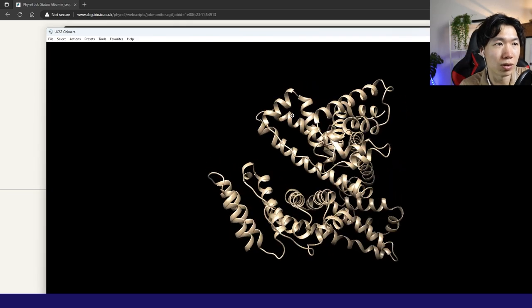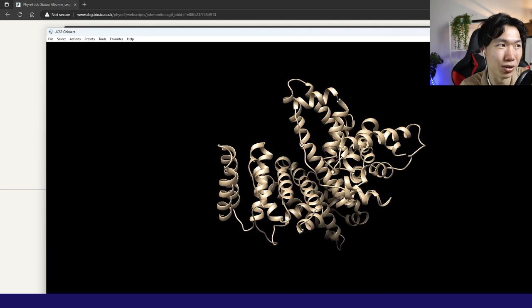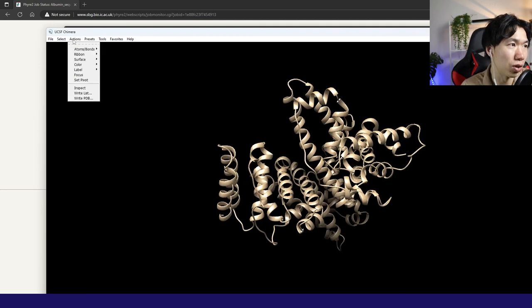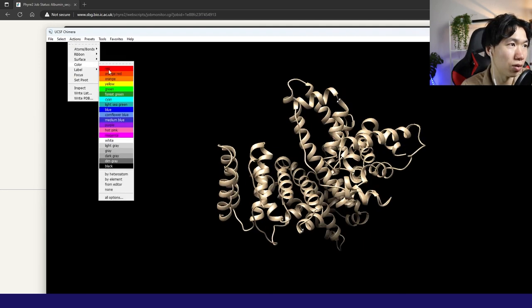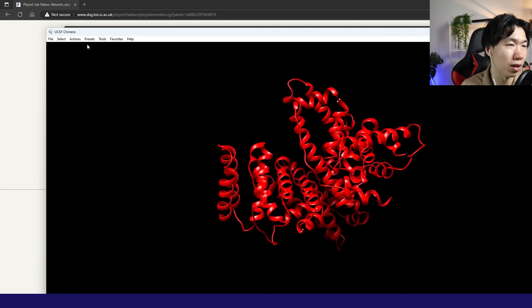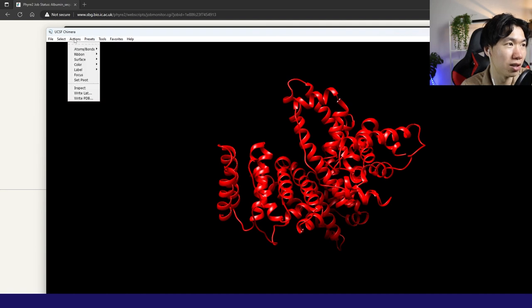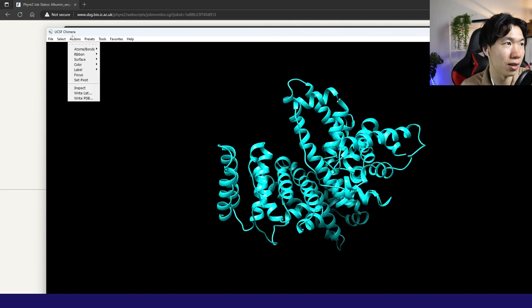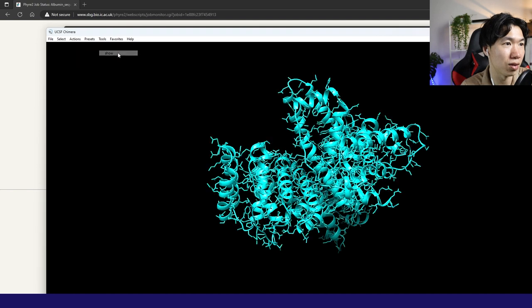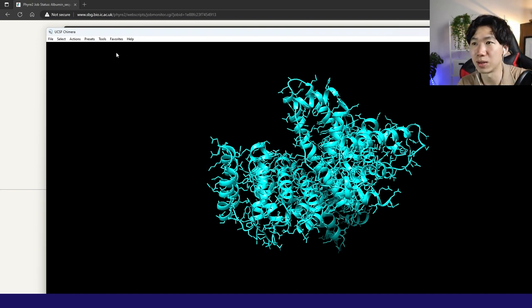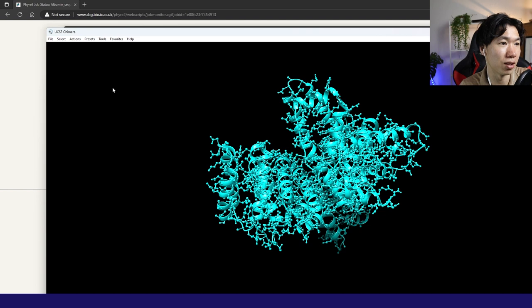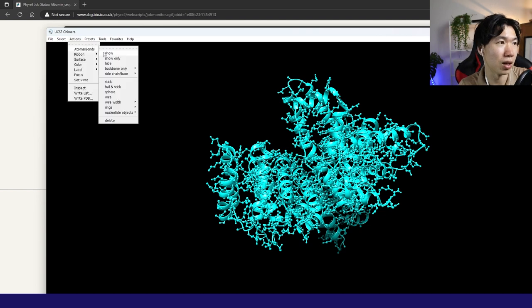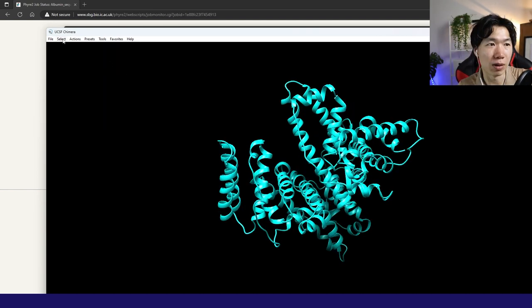Okay, and what if you want to color your protein model? Usually, I would not color in here. Color red. Or you can change it to red. What else? Cyan. Atoms, bonds. Let's see. Oh, you can also show atoms and bonds. And what else? Balls and sticks. Look. And how do I hide them? And you can also hide them again.